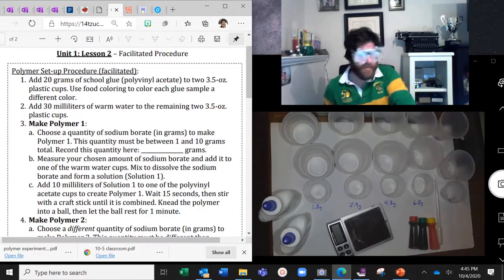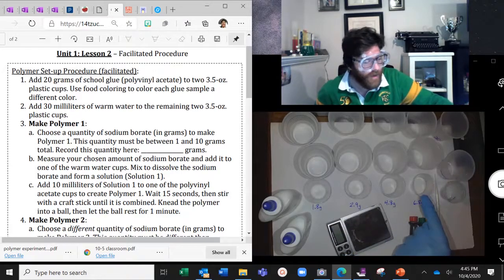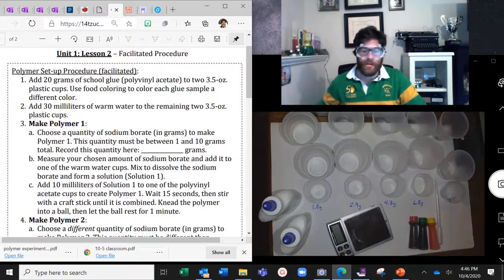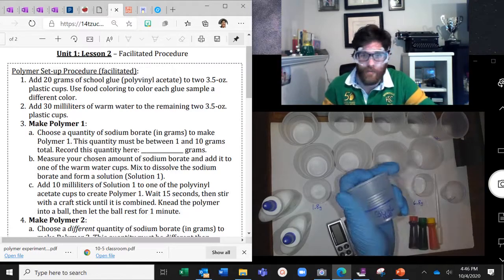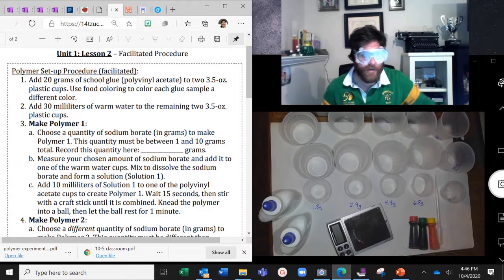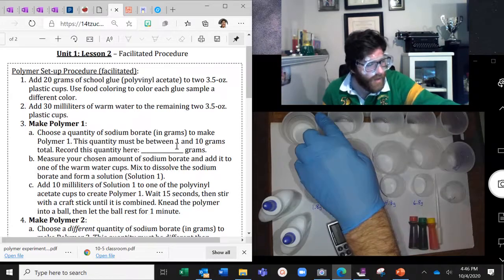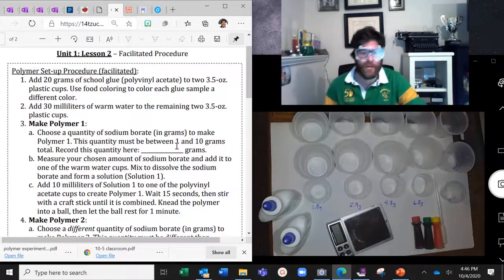So I have some different amounts of borax or sodium borate weighed out, and I have their masses written here: 1.8 grams, 2.9 grams, 4.8 grams, and 6.8 grams. We're going to be mixing those different amounts, each with 30 milliliters of water. So all four of these cups are going to get filled with warm water. And then we're going to have about 20 grams of glue. Okay, so each of these cups is going to have glue, and we're going to color each of those different colors so we can identify what they are.